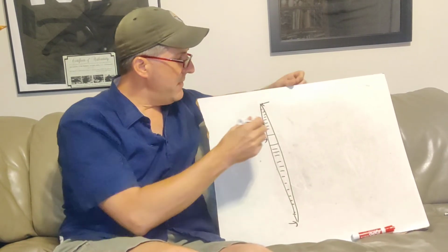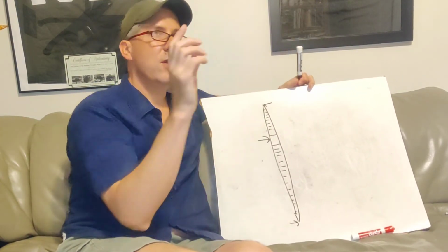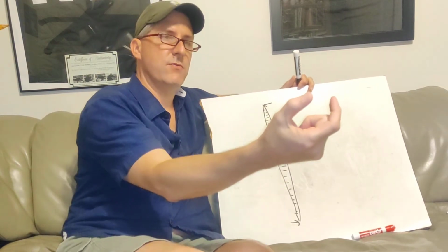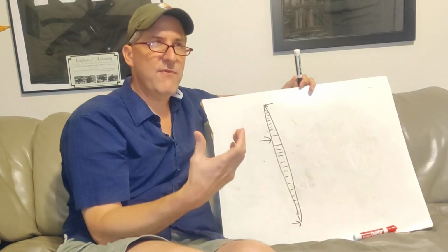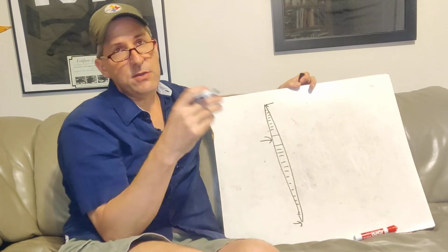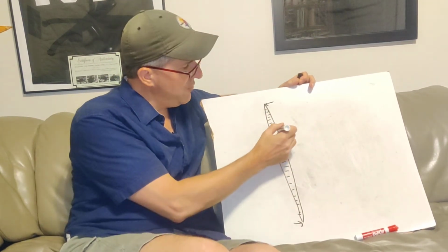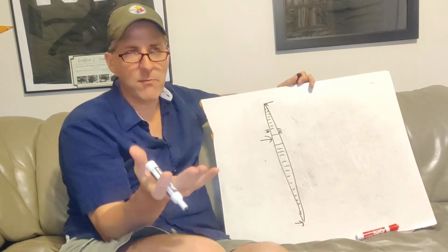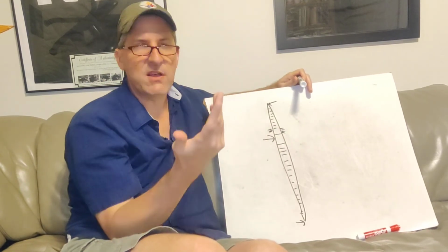All right, now for the earthworm. If you have the earthworm, where they were dark on top, light on bottom, what I would tell you to do is take your fingers and basically pet your worm. You take the worm and you run your fingers along it. What you would feel, it feels like 5 o'clock shadow coming off of it. Why? Because there's 4 pairs of setae or chaetae per segment. There's 4 on the left, 4 on the right. You can only see them well under a microscope, but it looks just like 5 o'clock shadow.